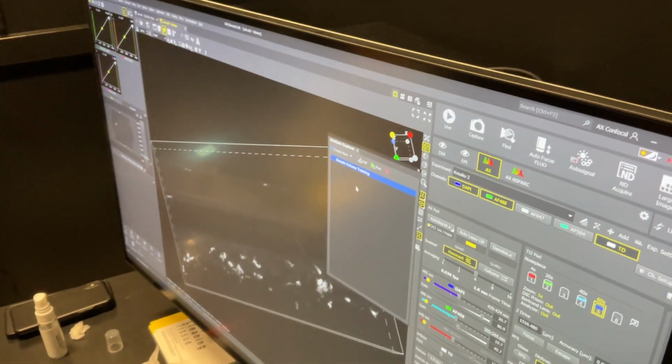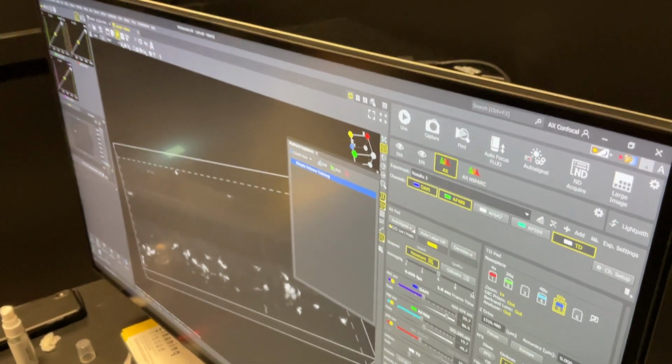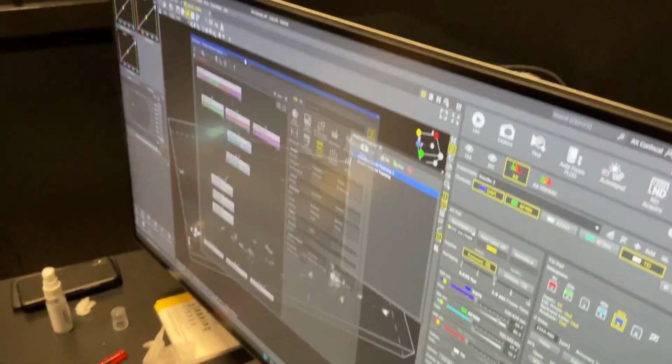Now this is in line with my more complicated analysis, where it's distinguishing between infected and uninfected cells, having another layer. Well, let's duplicate this, and we're just going to work on that one.